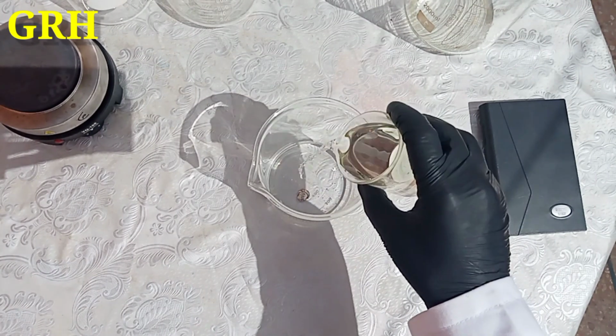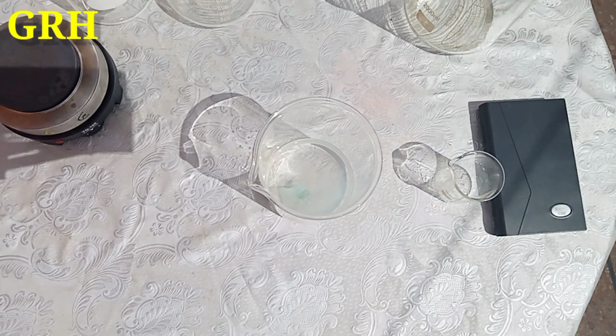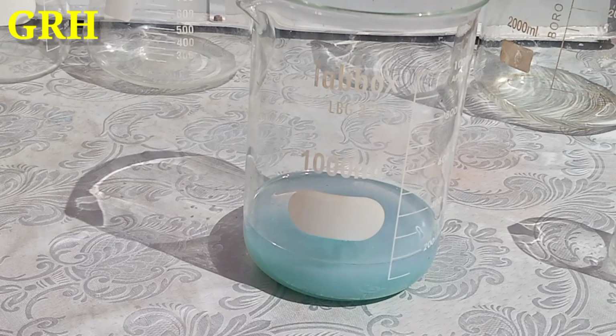If the acid is added to the water in a large quantity and too fast, heat may be generated so fast that the containing vessel will burst. When large additions of an acid are required, you must only add a small amount at a time and let the reaction cool down in between.